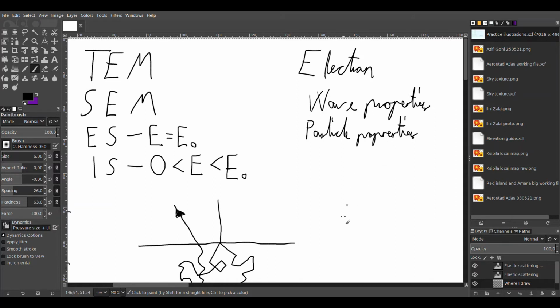Imagine I spelled properties right here. Not properties or whatever I wrote there, but pretend it says properties. So an electron can kick out another electron as if it was a ball kicking out a ball, but it also has wave properties. Hence we can make these electron beams and have optics. We can use optic rules on electrons, like the way light goes through lenses.